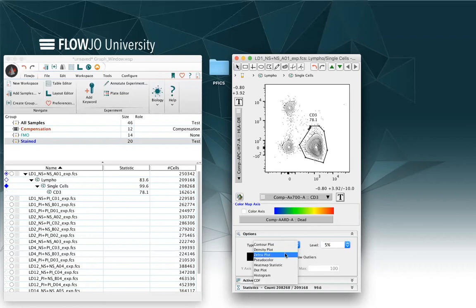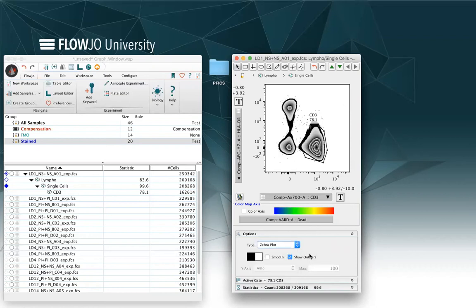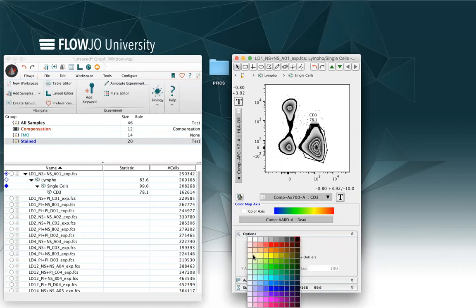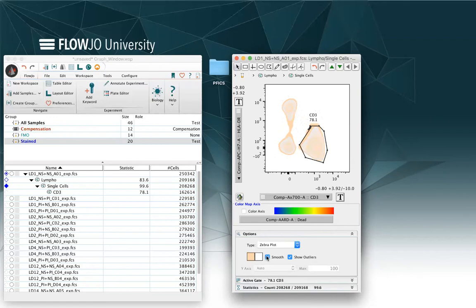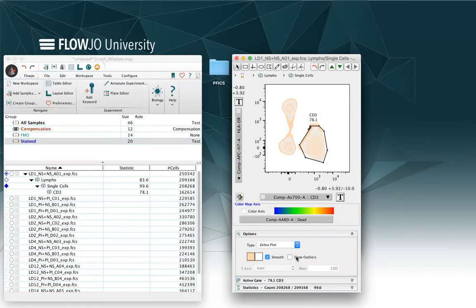Or I can use a zebra plot, which is a mix between a contour and a pseudo color. Eventually, I can select the smoothing and I can choose to see or not the outliers.